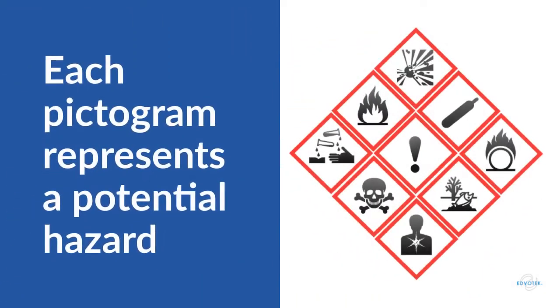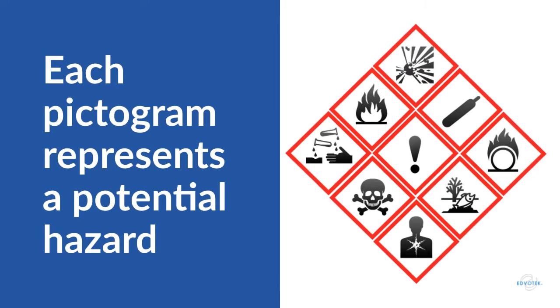For chemicals, each pictogram represents a potential hazard. For example, flames mean a chemical is flammable, and the skull and crossbones mean something is toxic. Both SDSs and product labels use pictograms to quickly communicate a product's potential hazards — no words needed.